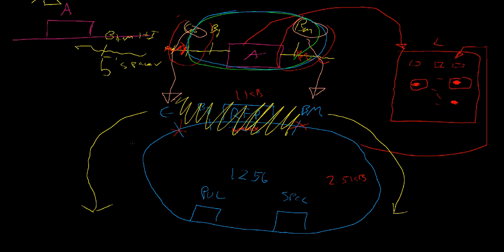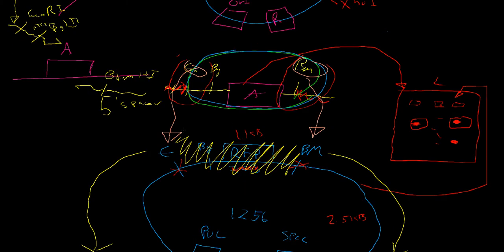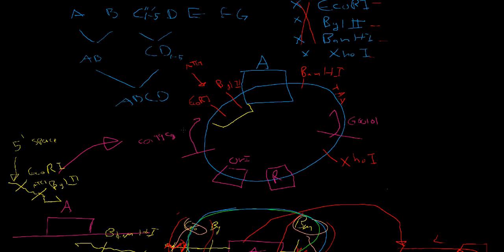We just add some ligase. Again, we have a liquid handling tutorial on that. And you get this plasmid that looks like what we had originally. We get something up here. So our A just drops in at this Eco and this BAM site. And that's pretty much how you do an Eco-BAM transfer.